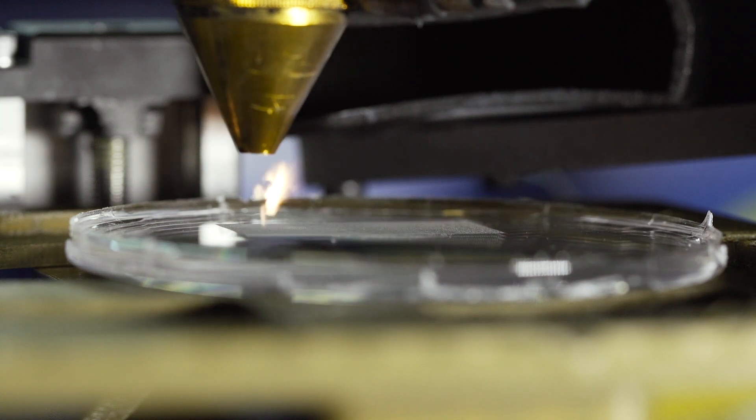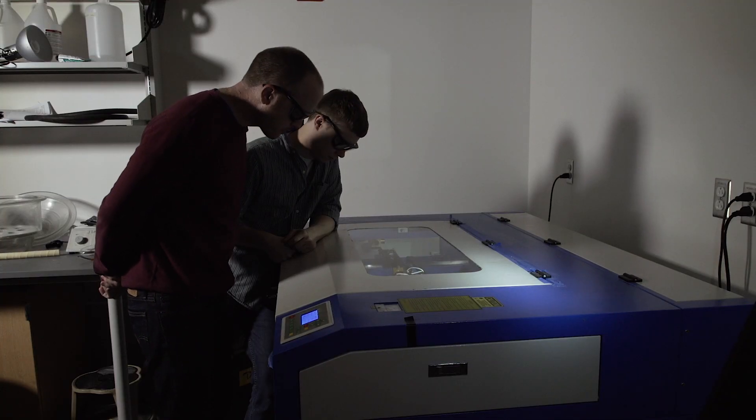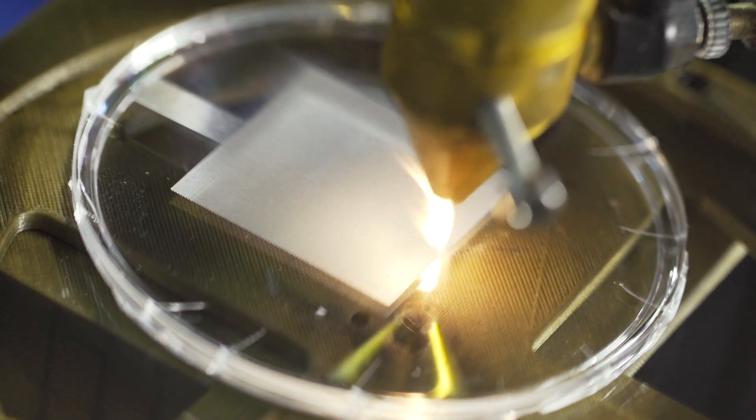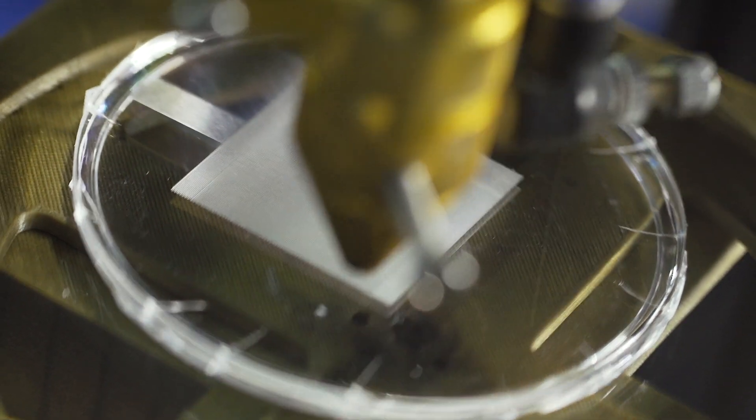With this microfabrication project, we're trying to figure out better ways to make microwells. We want to make microwells to be able to form clusters of cells — maybe 50, 100 cells per cluster.